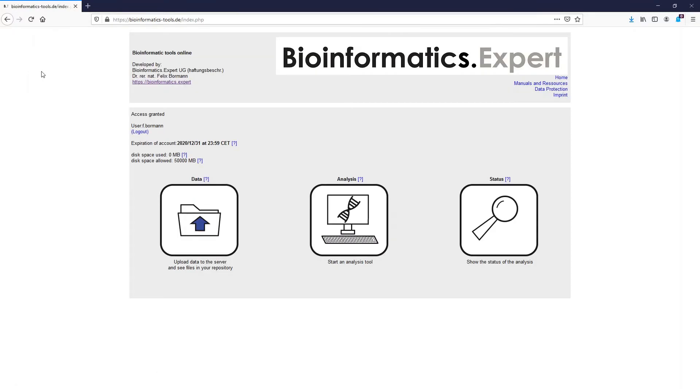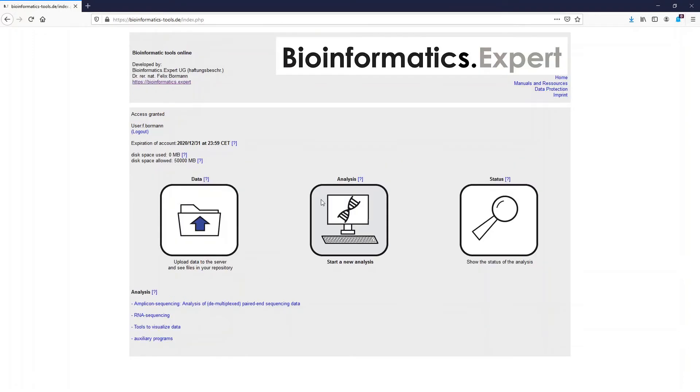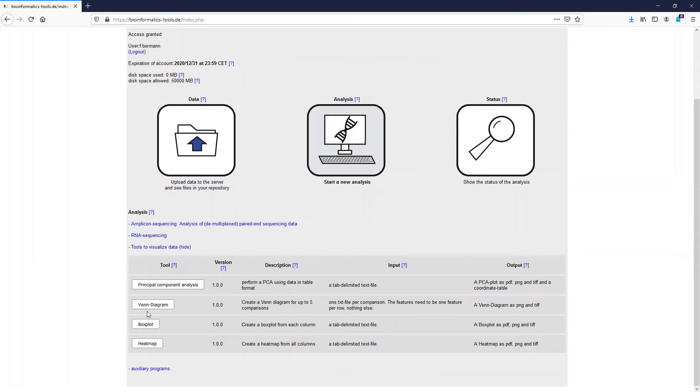After you have uploaded these files you can start the analysis easily by clicking on analysis. Then select tools to visualize data and click on Venn Diagram.